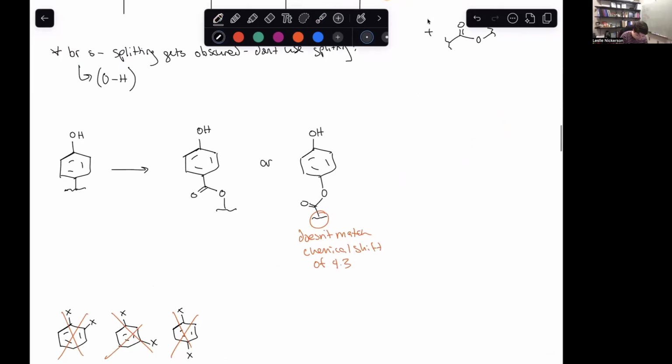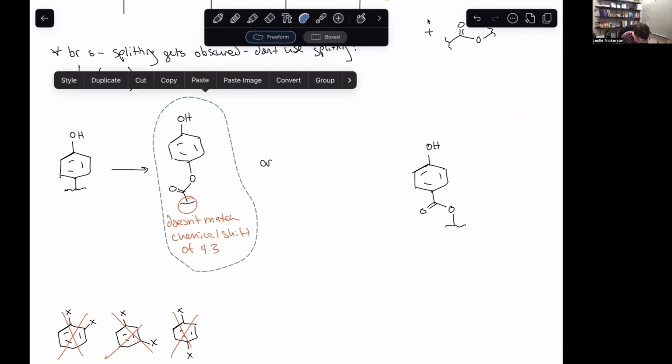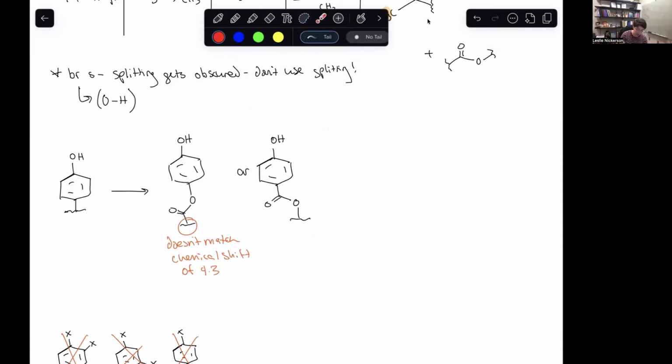So that means that this one is looking to be a pretty good option. I'm actually going to swap these so that I can continue on in my little progression here. Okay, so I've added my ester group here, and I'm putting stuff in all of the gaps that I identified.